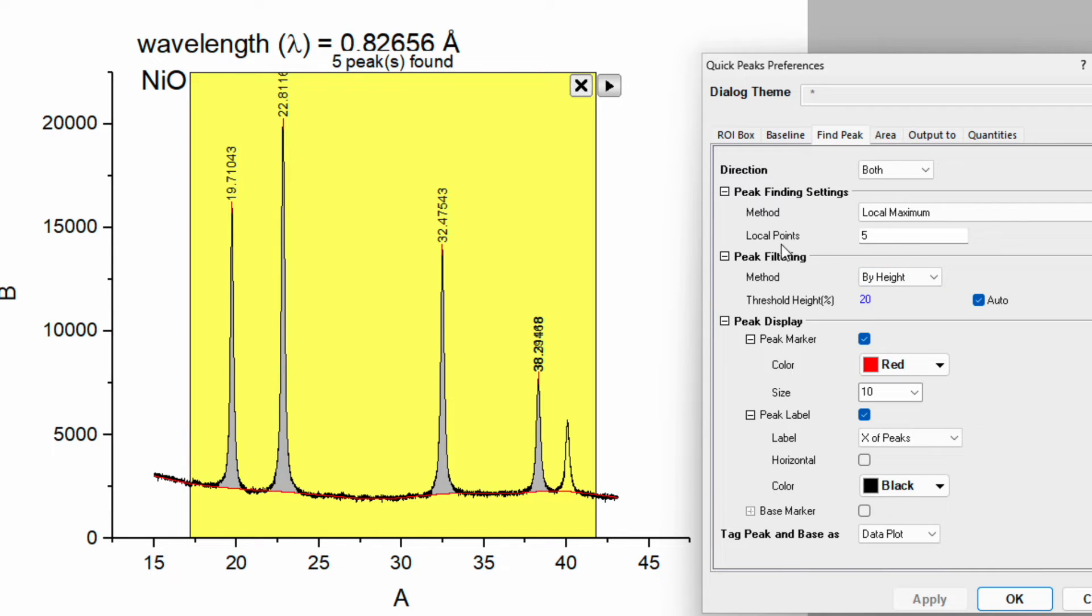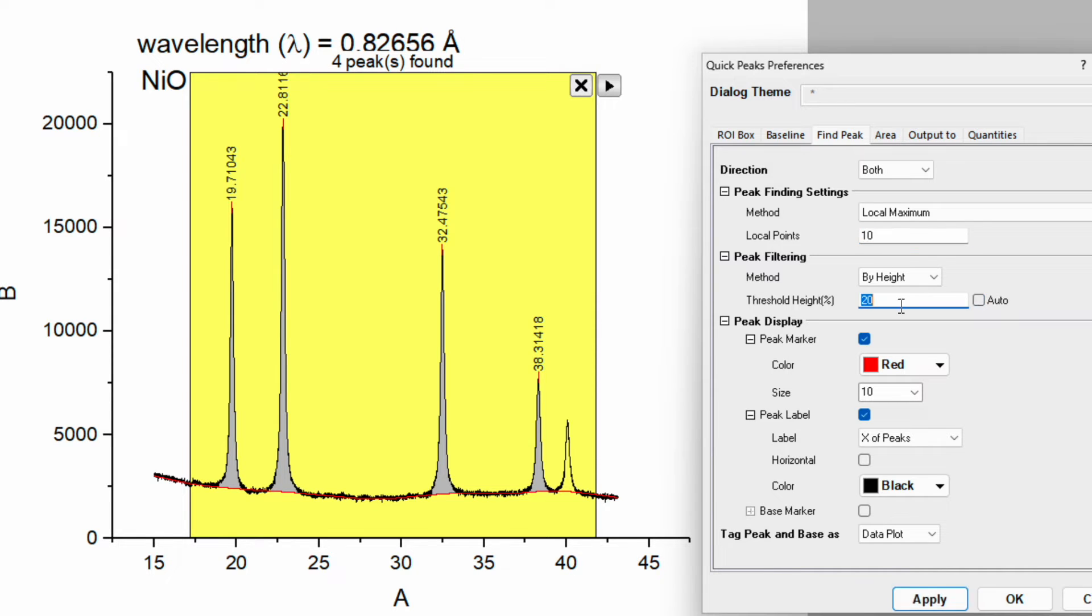In find peak you can see there are two options. One is local point. So tune this number to say 10. Tune this threshold height to 50. Apply and then click OK.